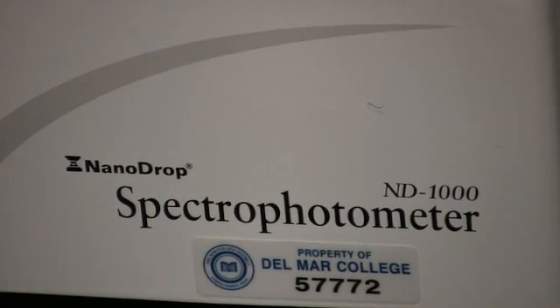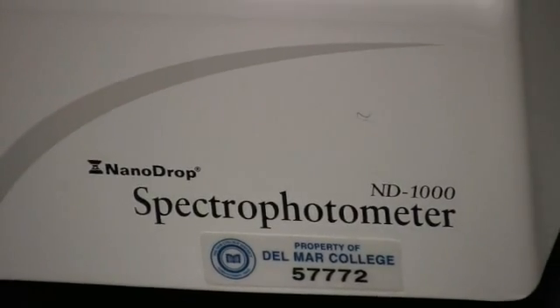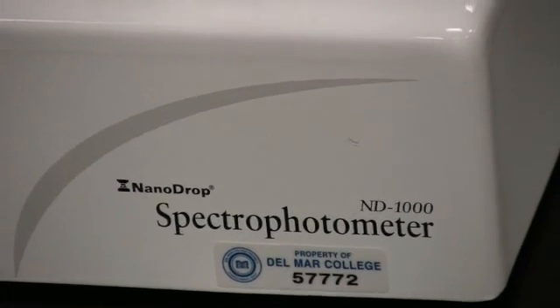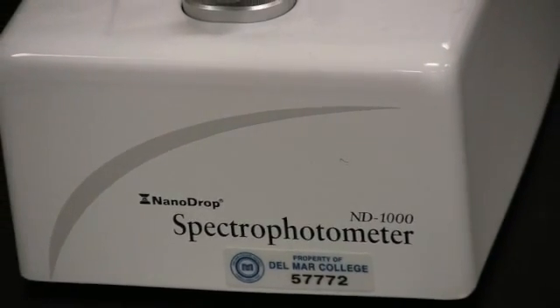The Nanodrop 1000 is a type of spectrophotometer, a tool used in quantifying nucleic acids, DNA and RNA, as well as certain proteins.